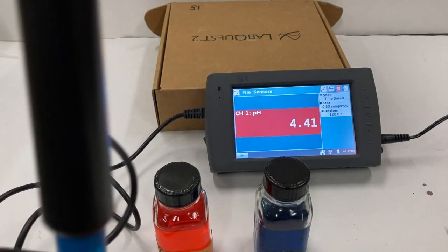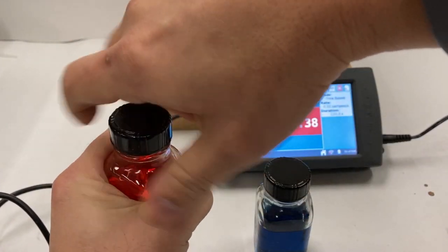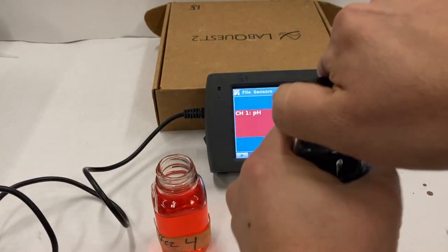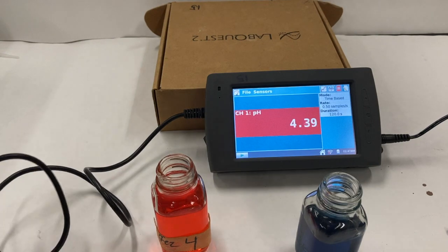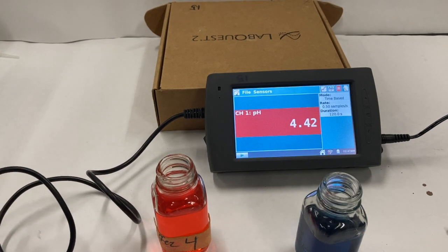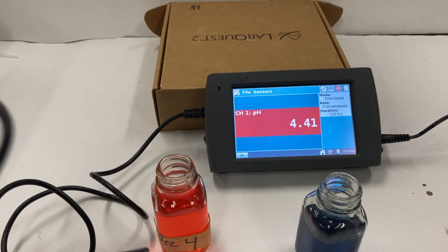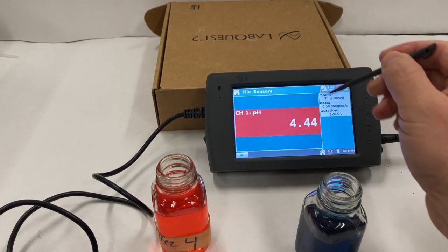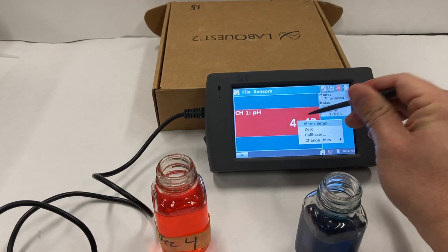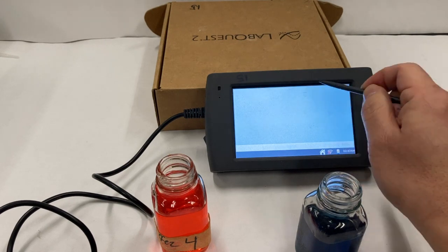All right, so I've plugged in my pH probe, and one of the first things that I should do is calibrate the probe. And this is generally something we need to do because the probe sits for a long period of time in storage, and it's really only used during one time of the year, towards the end of the year, because that's when the acids bases unit is. So to calibrate, just need to tap on the meter, click calibrate. Yes, I want to calibrate now.